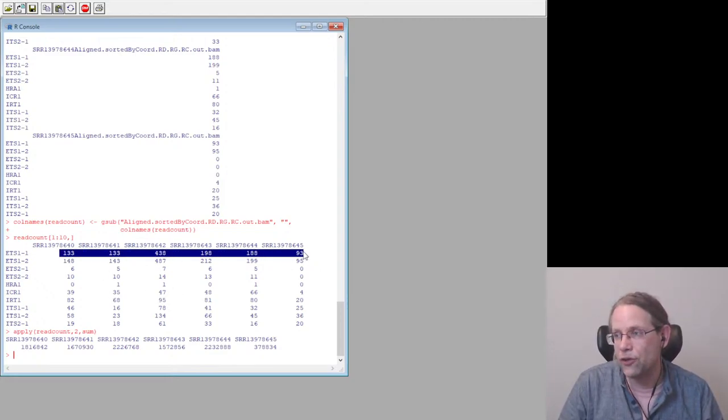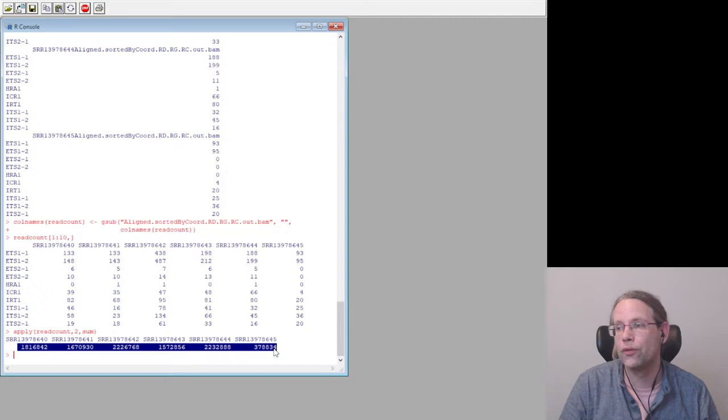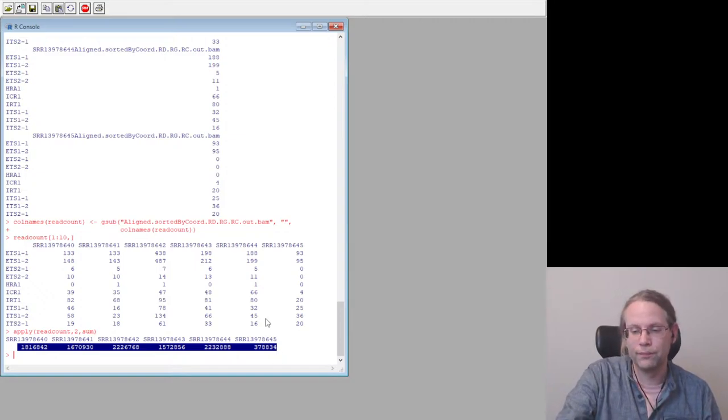All right, so we have to look at the read counts, but the read counts have to be interpreted based on the total amount of reads that there are. So that is going to be the next step.